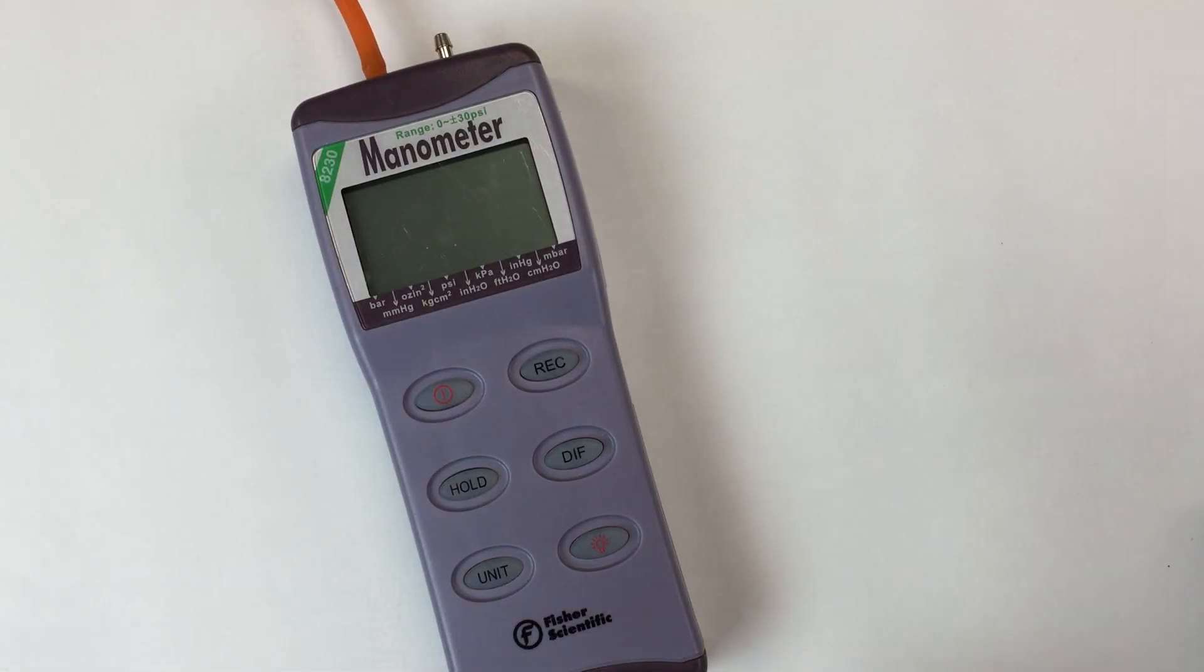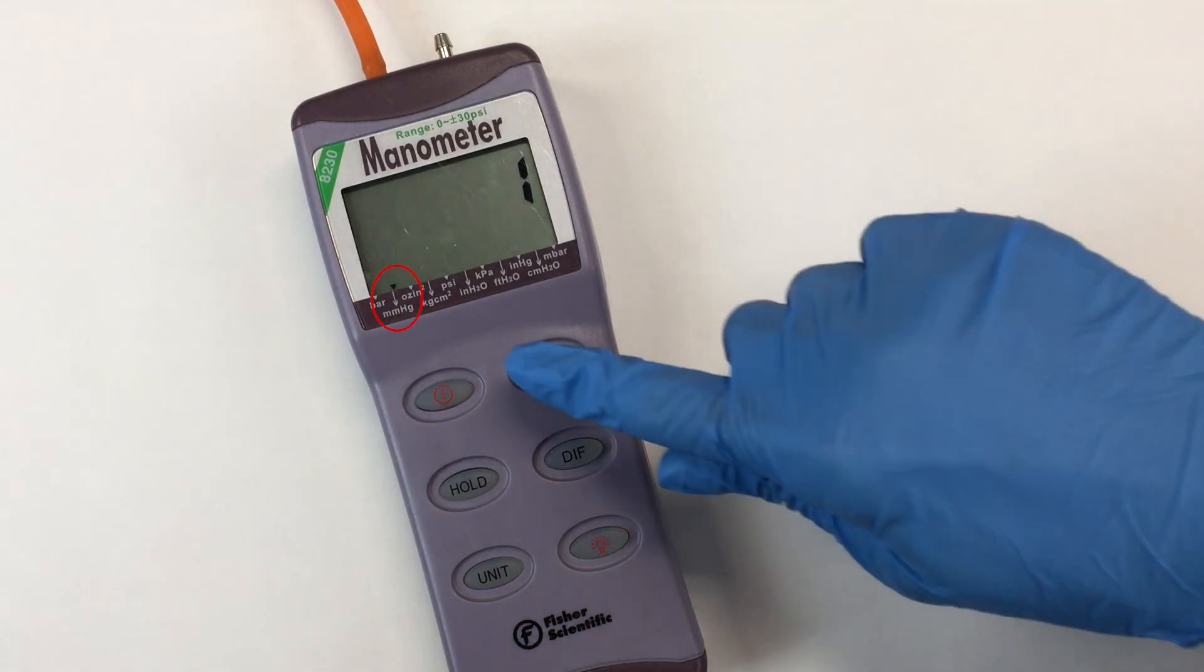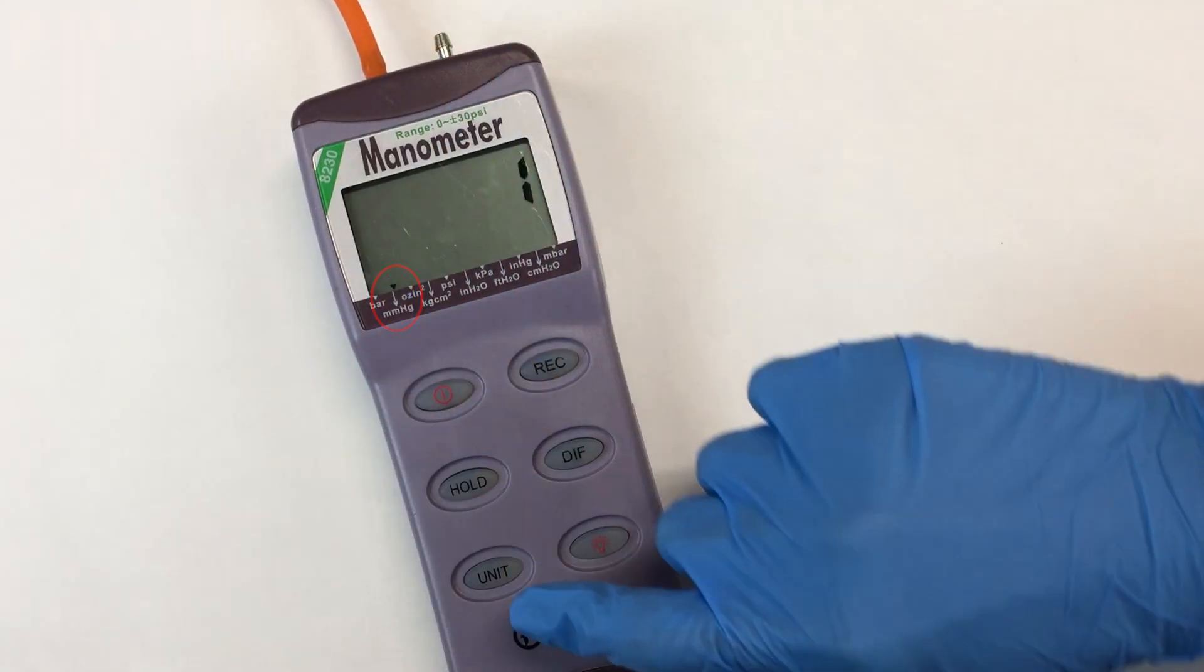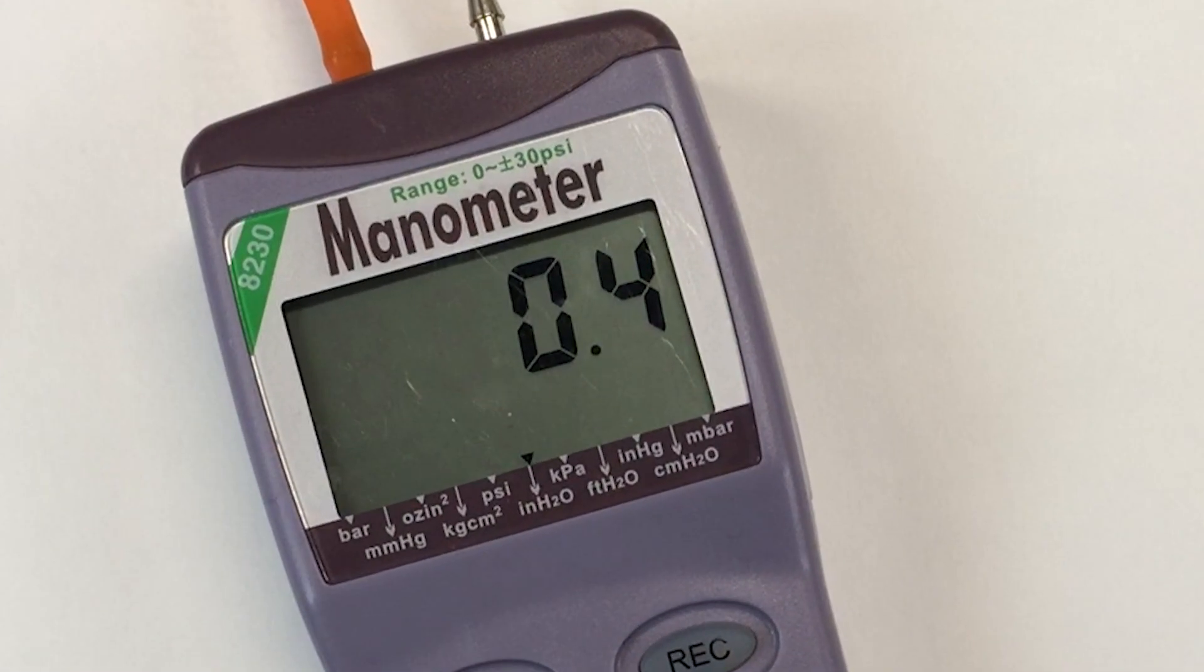Turn on the manometer using the power button. It should be set to millimeters of mercury. If it is not, you can use the unit button to cycle through the various units available until millimeters of mercury is indicated.